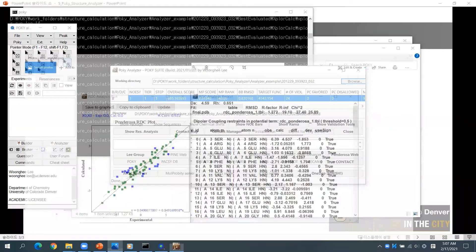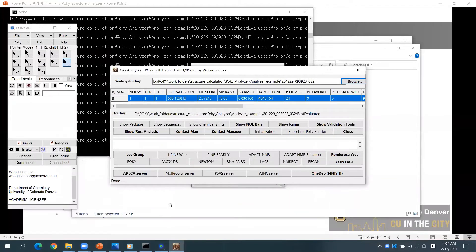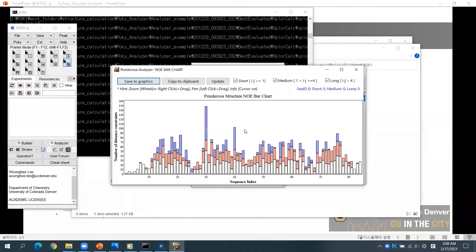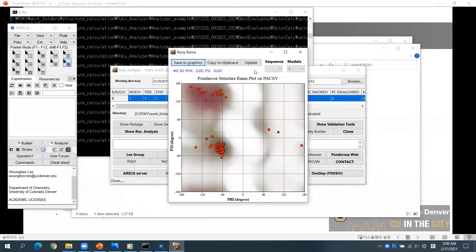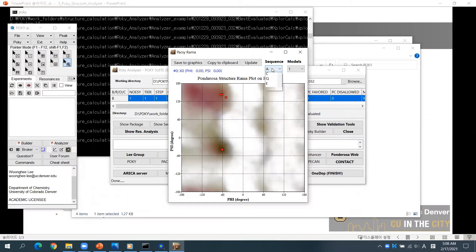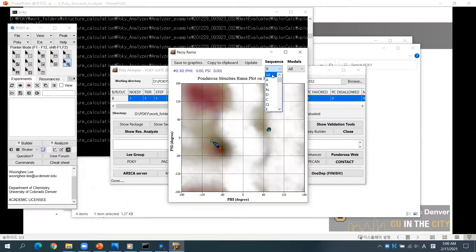If you want to see a NOE bar chart, click Show NOE bars. If you want to check a Ramachandran plot, click Show Rama. You may select a certain residue, or model, or even OR as you need.